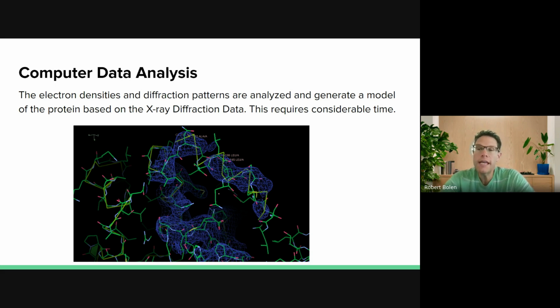And this is what's going to take us the most time. Collecting the data actually doesn't take that long. It's a few hours during a day at the lab. Analyzing the data can take weeks, if not months, because you have to go through this and painstakingly position it so that it fits the cloud data.